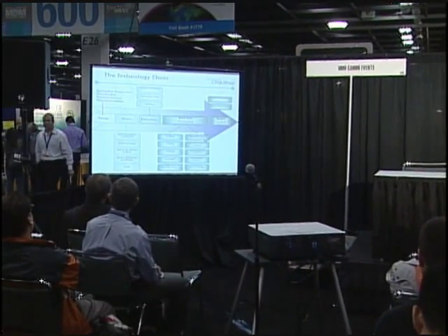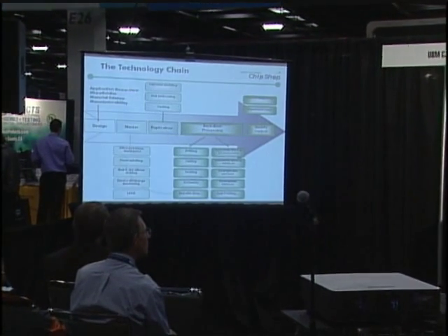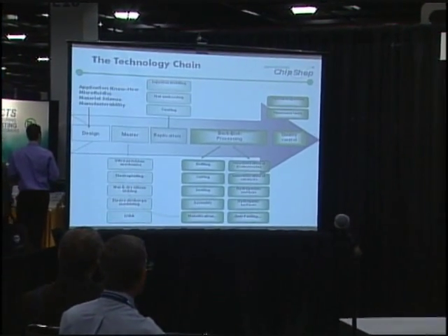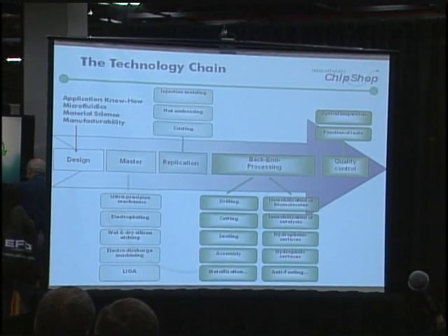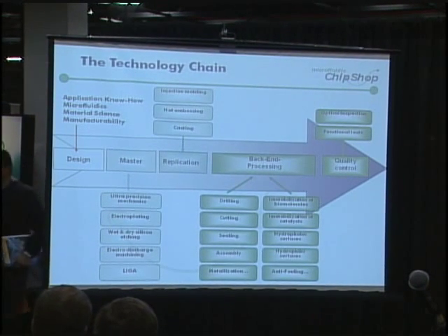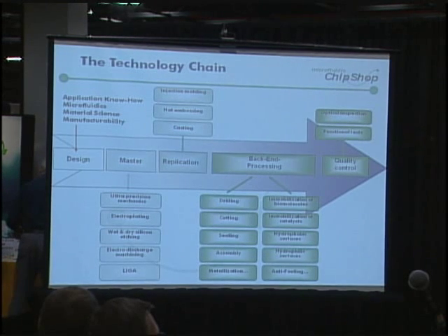Microfluidics, of course: you have to know the physics of microfluidics. You have to be able to calculate back pressures and distribution ratios and stuff like that. Material science, again, much is surface chemistry, so you have to understand what your material is doing to whatever liquid you have in there. Or people use, say, laser-induced fluorescence as a detection technology, so you have to understand the optical properties of your material and so on. And finally, as I said before, manufacturability has an important influence on the design already.